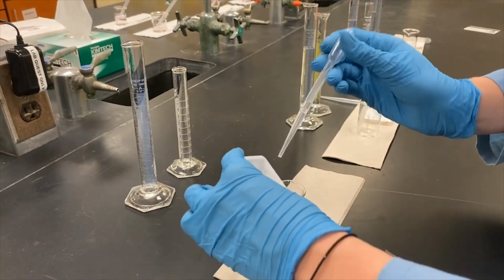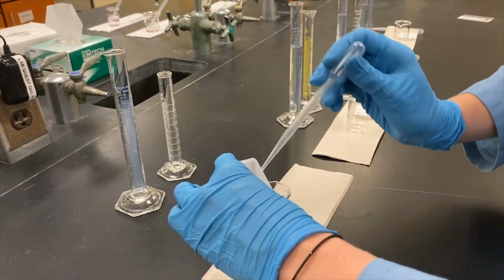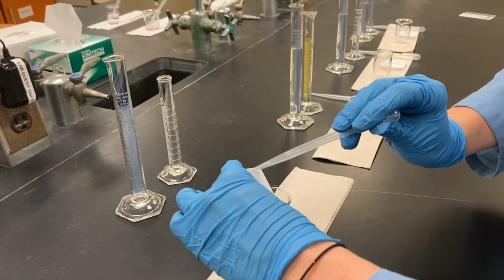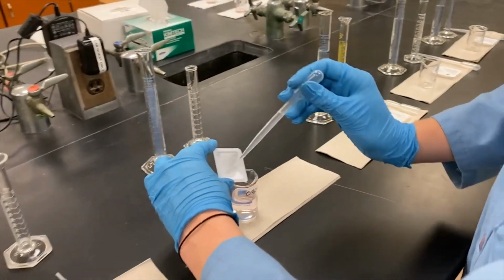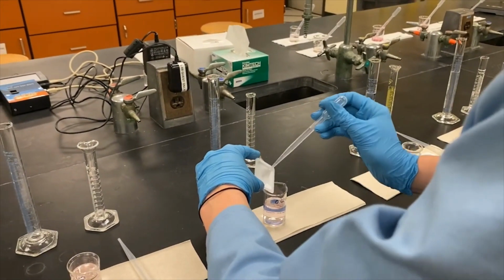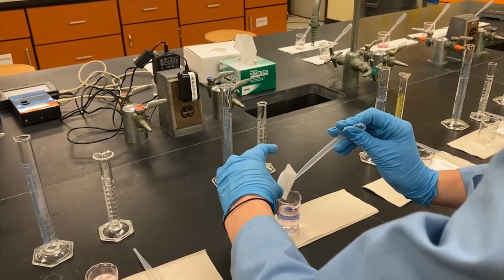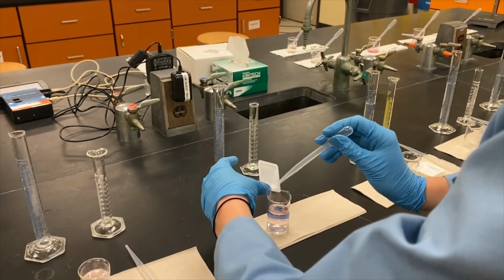And we're using a different pipette each time because we do not want to cross-contaminate between samples here. And this is why we're using disposable pipettes too. It just makes it a little bit easier. And I'm just going to carefully make sure that all of the DPD makes it in there.